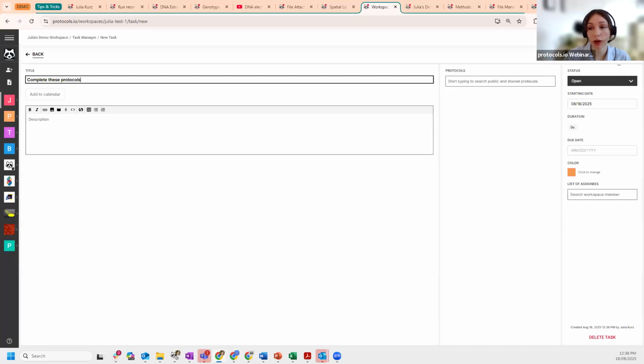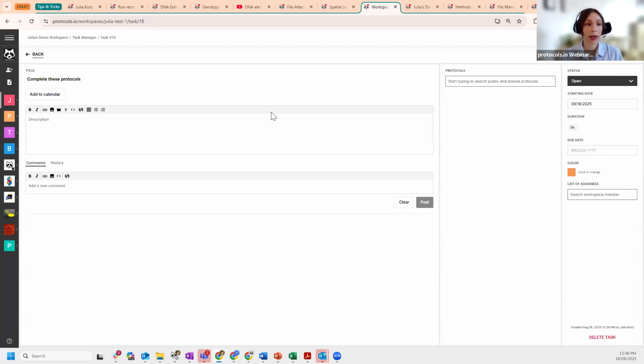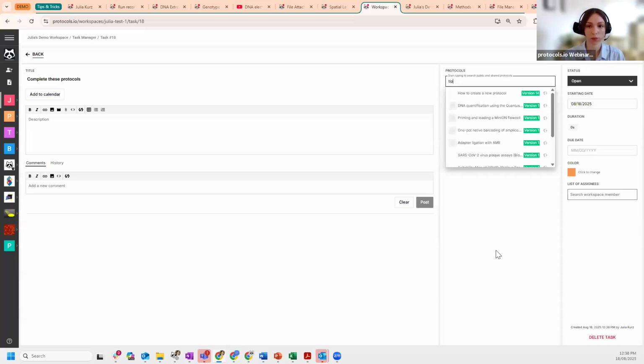You actually have to give it a title and save first. And so I could just assign a task like that to a specific person, but I'm going to assign specific protocols. So let's assign that tips and tricks protocol. Oh, being a bit slow today. There we go.